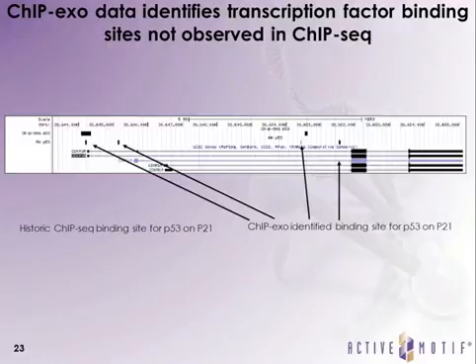not only to look at the binding sites that are already known and getting more concise identification of those binding sites, but you can also find binding sites that were previously unknown to your previous ChIP-Seq data.